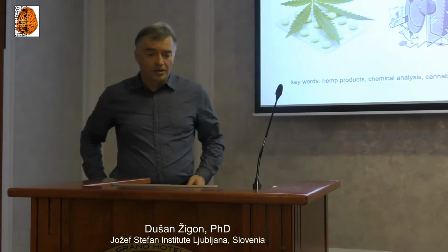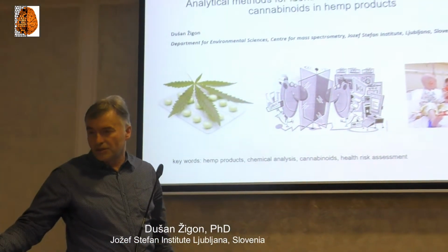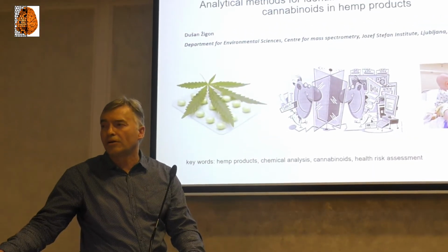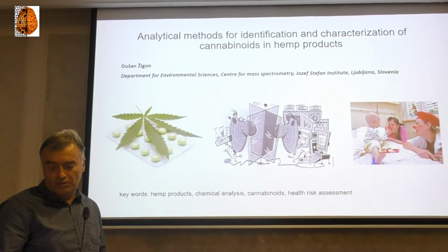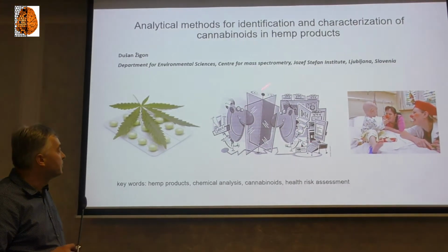Good afternoon, everybody. In my presentation, I would like to describe characterization of cannabinoids in hemp products from an analytical point of view, starting with hemp products, whatever they are, following the analytical procedure presented here.